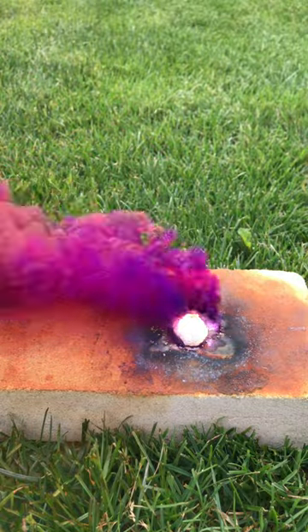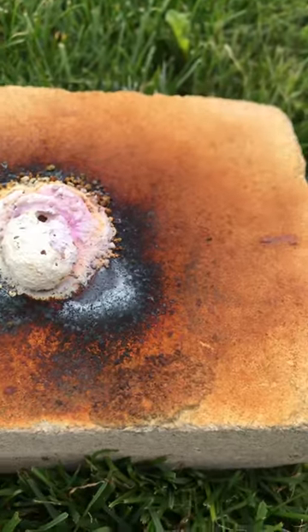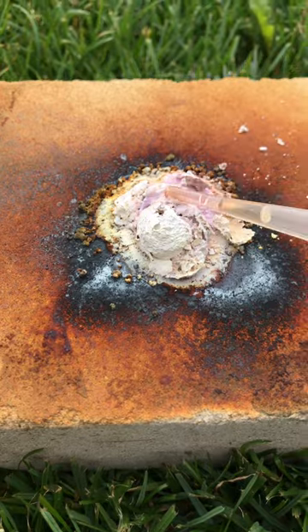The vapor, despite looking beautiful, should not be inhaled because it is toxic. And as promised, the aluminium iodide is colorless, and therefore we were left with this white blob after the reaction was finished.